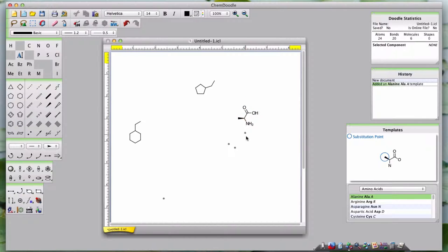It is important to ensure you select both atoms correctly for your Substitution Point. Incorrectly chosen Substitution Points, either in the widget or on the doodle board, may result in incomplete transfer of the template to the doodle board.